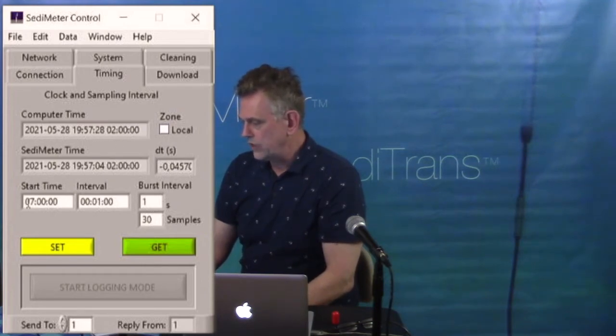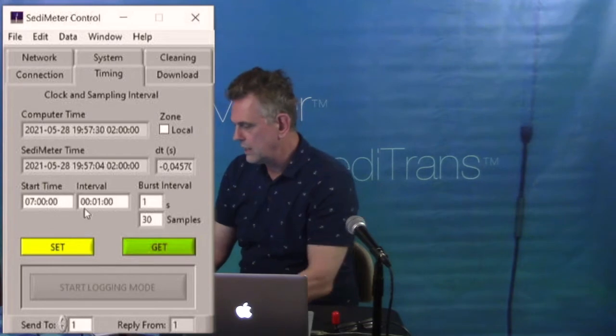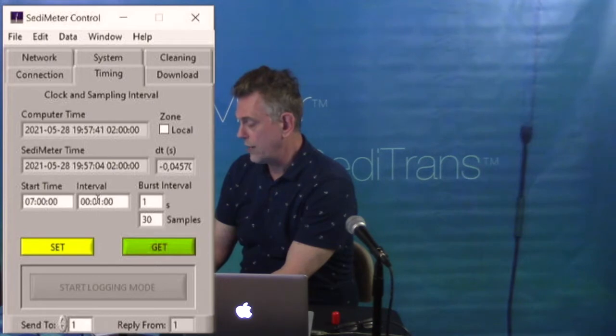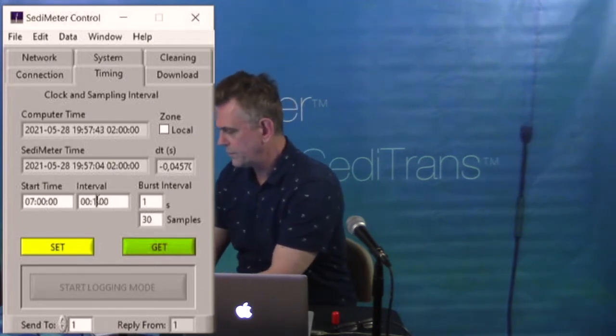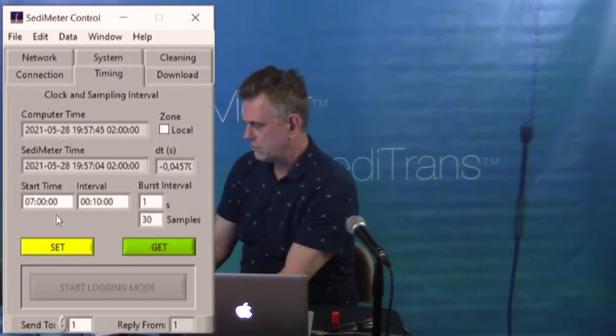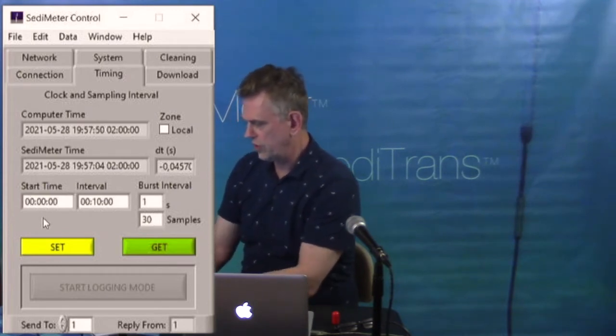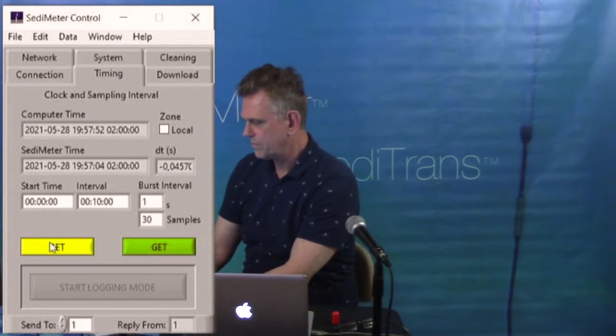And then down here you see start time and interval. The start time is hour, minute, second. And interval is hour, minute, second also. So let's say we want to measure once every 10 minutes, starting at midnight, that would be 000000. And then we click set.